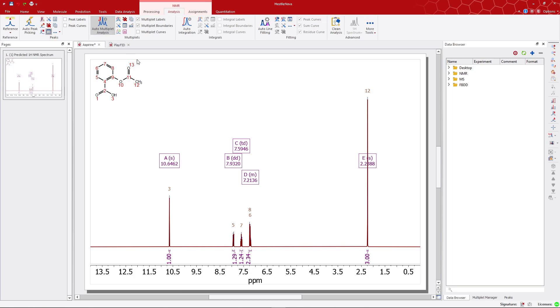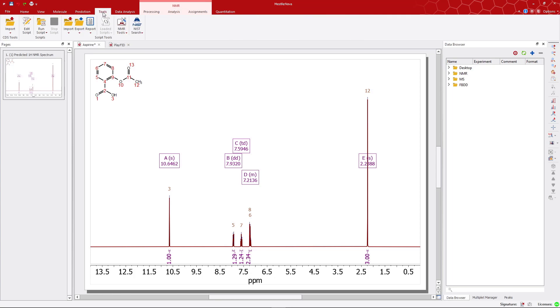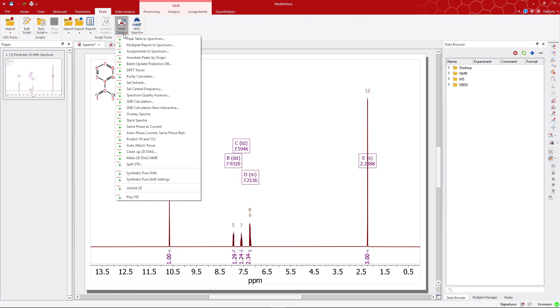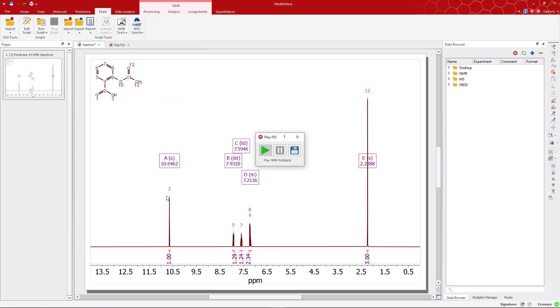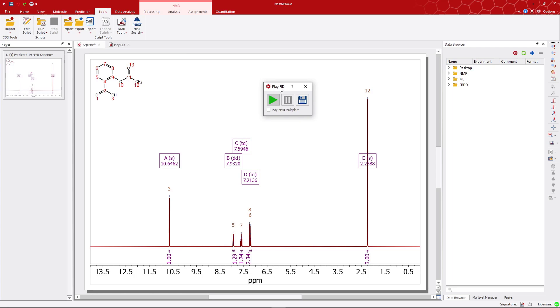Then, navigate to the Tools toolbar and click on NMR Tools. Select Play FID and a dialog window appears. Click on the Play button and you will hear the FID of the spectrum.